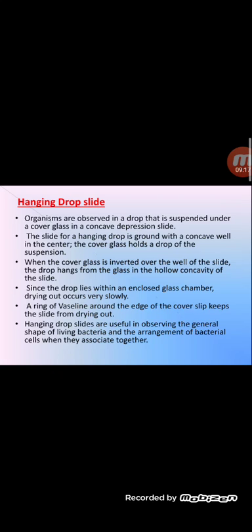So it forms a water drop. This drop is in a glass chamber. Since the drop lies within an enclosed glass chamber, drying out occurs very slowly. So since it forms a glass chamber, the drying up of the slide will slow down.